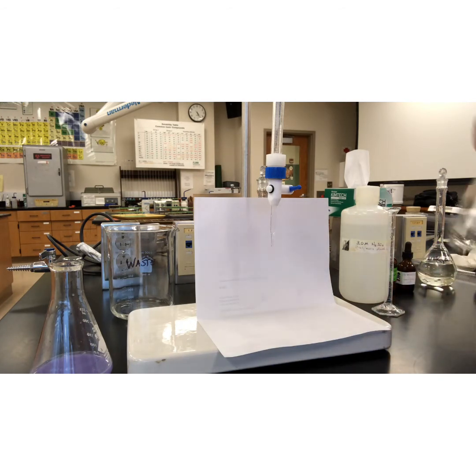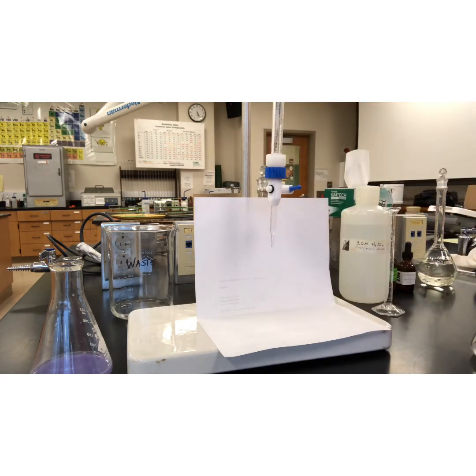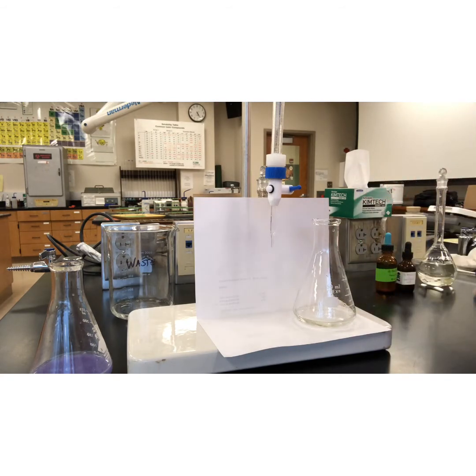Okay, I've got my 25 milliliters of potassium ferrocyanide that I pipetted earlier. Didn't want to do it more than once. I got it all done with. Let's put that there so you can see it. I'm going to add about 5 milliliters of 3 molar sulfuric acid. Put the lid on more.